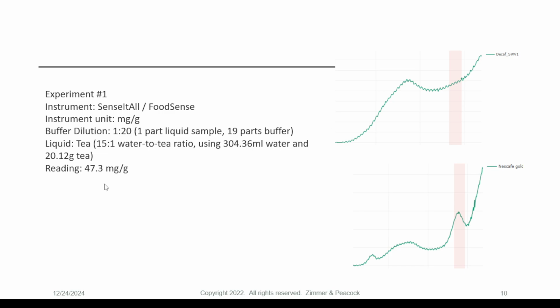So it's not a criticism of the users, but I would ask you to maybe try the experiment and not do too many, because you'll get ahead of us. 50 milligrams of tea leaves in 1 ml of buffer. Vortex it if you can. I appreciate you may not have the vortex at the moment. I always use a vortexer in many of the demos online. That will extract, and then you'll get the milligrams per gram.